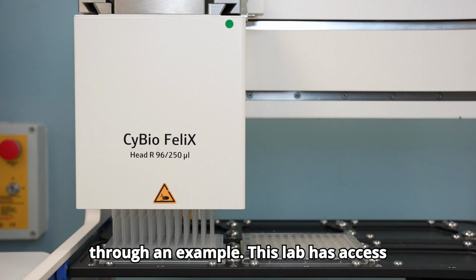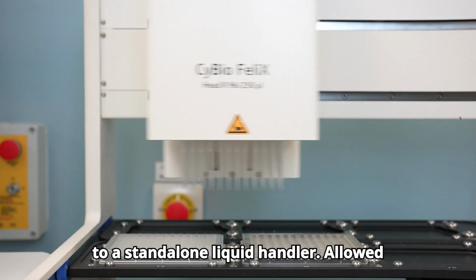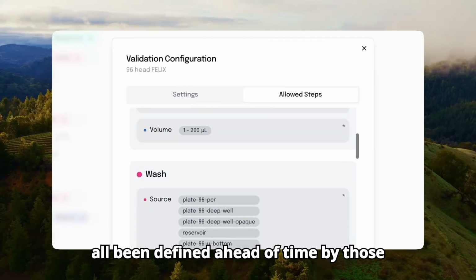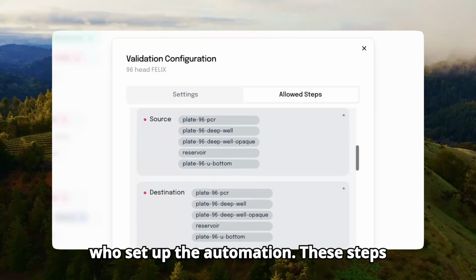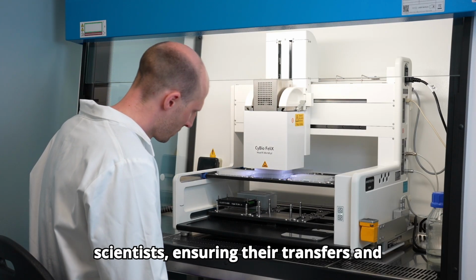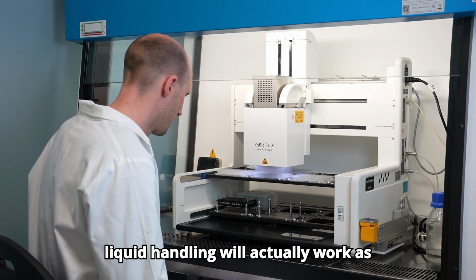Let's walk through an example. This lab has access to a standalone liquid handler. Allowed steps, labware, and parameter ranges have all been defined ahead of time by those who set up the automation. These steps are validated before they're exposed to scientists, ensuring their transfers and liquid handling will actually work as intended.